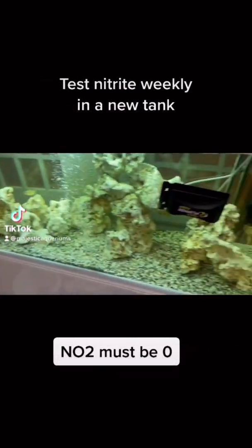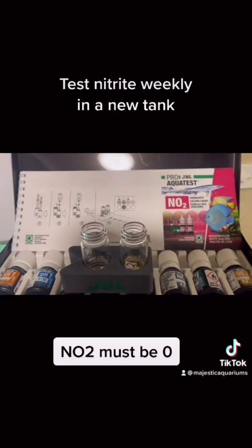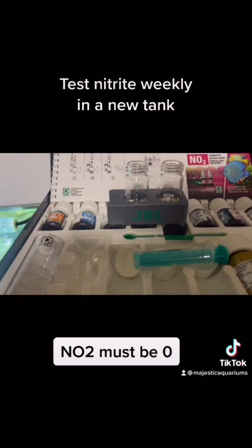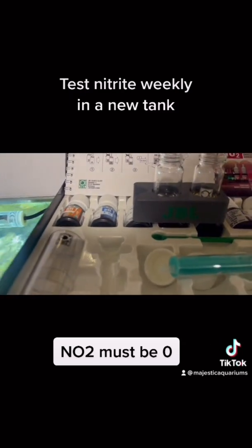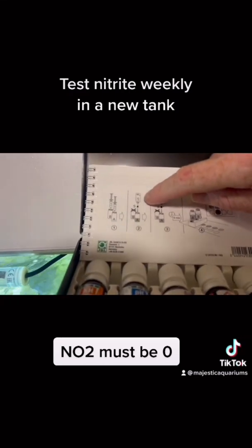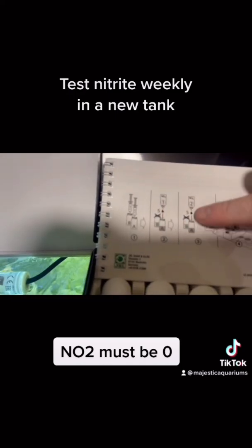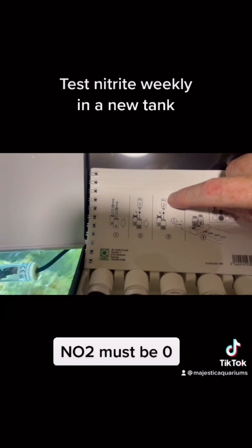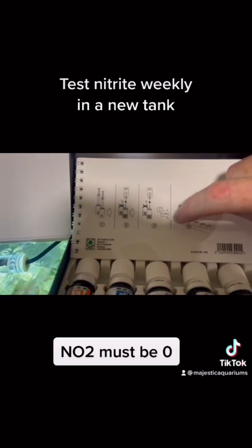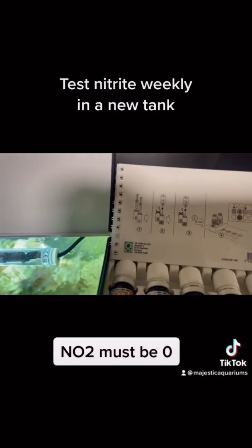So next we're going to check the nitrite. After the ammonia is broken down by bacteria in the filter into nitrite, we need to know how to check the nitrite. What I've actually just done is get NO2, which is nitrite. Number 1, we put in 5 drops, give it a shake. Then NO2 number 2, we put in 5 drops, and then we wait 5 minutes. Now I've already done this, so that's here.